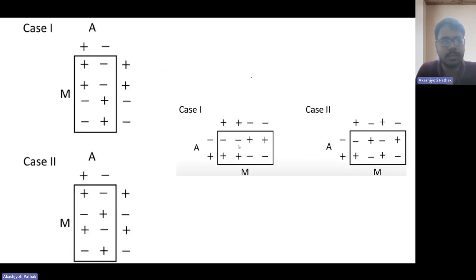So for AM, you have two peaks, depending on whether this A is on the F1 axis or whether this A is on the F2 axis. In this case, A is on the F2 axis, this is the F2 axis. And here in this case, A is on the F1 axis. So different cross peaks will have different fine structures. That is what is shown over here.